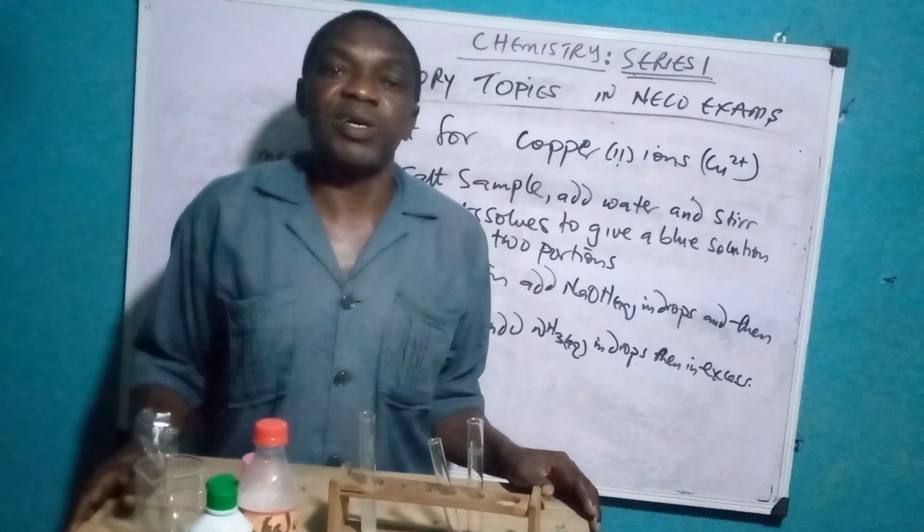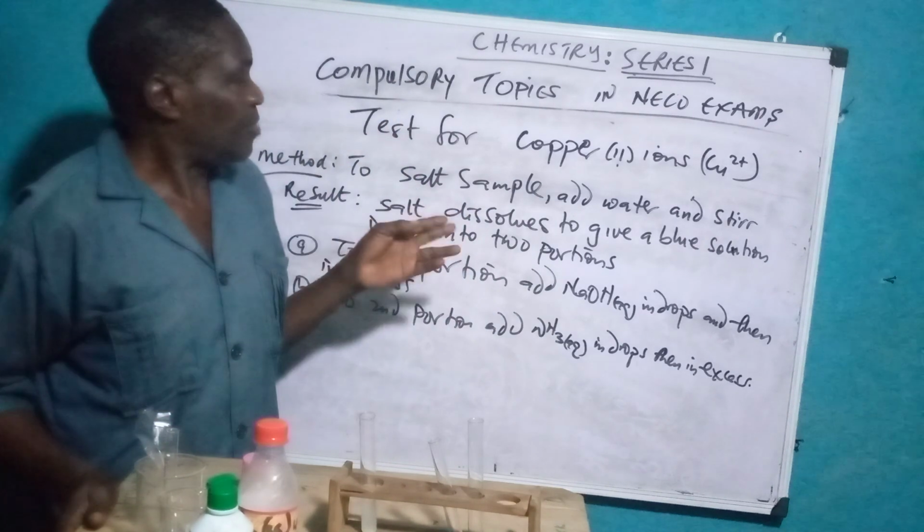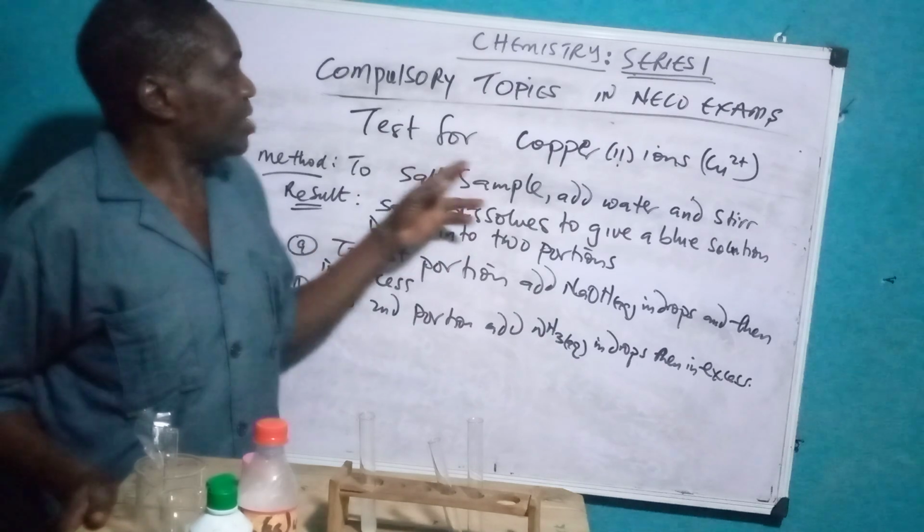Today we are going to carry out some chemical tests. First of all, for today's class, I'm going to carry out tests for copper 2 ions.